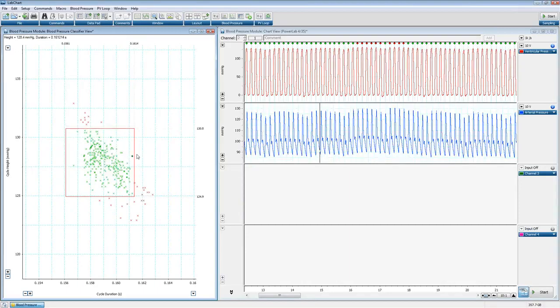If you're recording data and analyzing in real time, this view will populate in real time, just to let you know what's going on. So you can have it open while you're recording. And I'll probably do a really quick recording with our playback file feature later to show you how that looks.